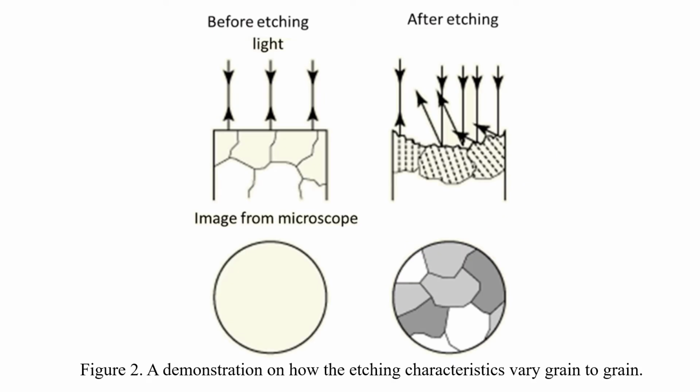The grain size is often determined when the properties of polycrystalline and single-phase materials are under consideration. It's generally considered that the hardness decreases monotonically with increasing grain size. This is because small grains tend to have more grain boundaries, which could behave as obstacles to dislocation motions.